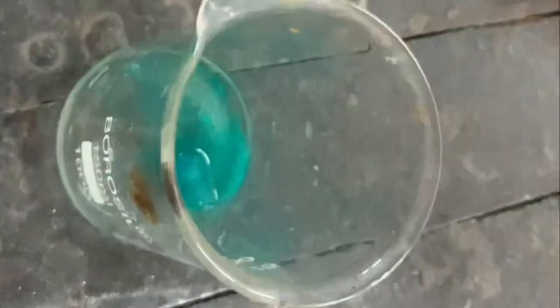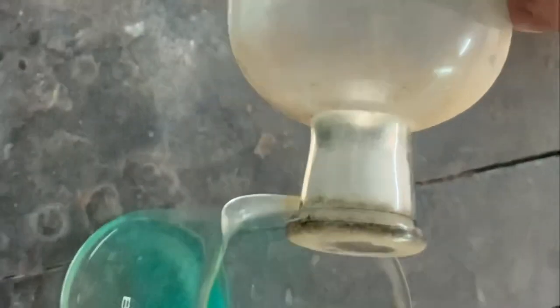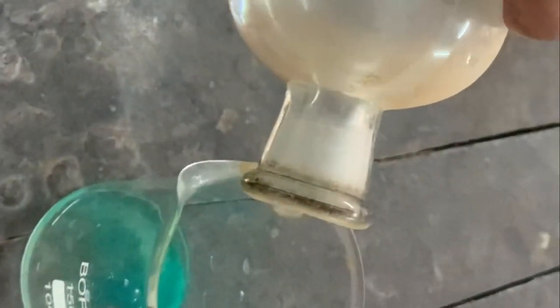So we'll transfer this nickel sulfate to a 150 ml beaker. And you can see this is 5 ml distilled water. Now we'll transfer this 5 ml distilled water into it, and a little hydrochloric acid, which is 2 normal, we'll add into it. Okay, and let us dissolve this.